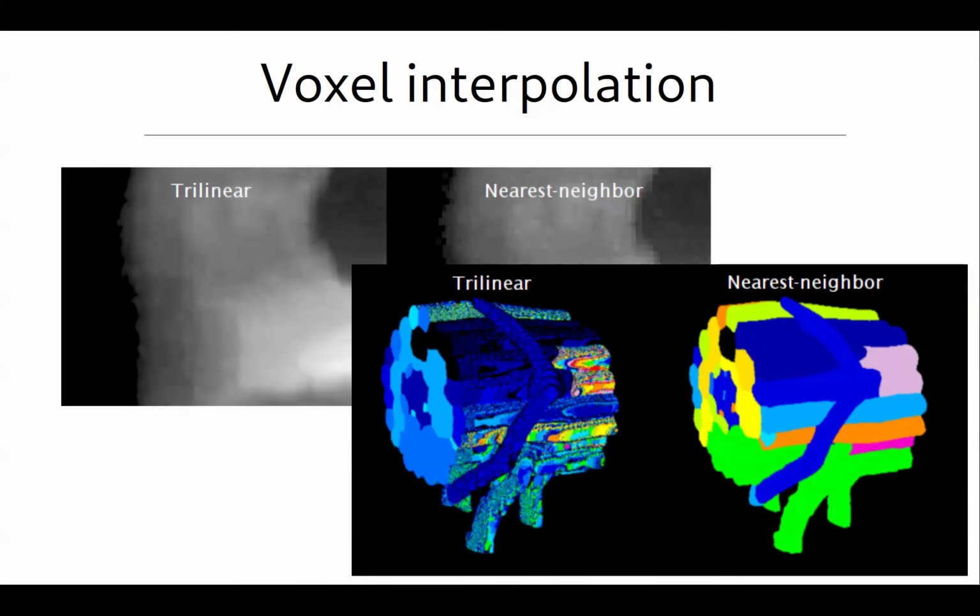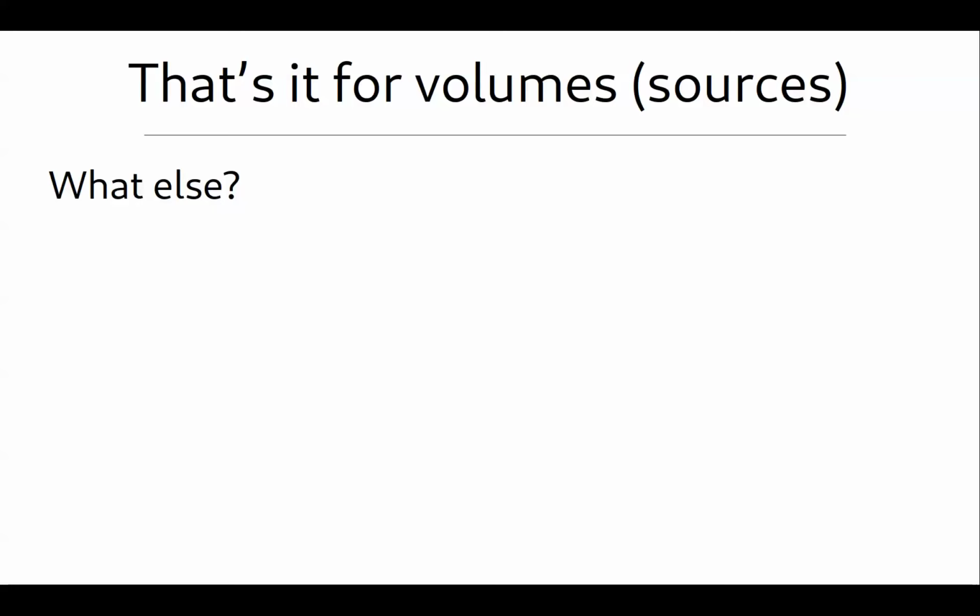Because at the boundaries, the segmentation data is where each cell, for example, the voxels of each cell, is mapped with one number: 1, 1, 1, 1, 1. And then next to it is 10, 10, 10, 10, 10. So then, of course, the interpolation in between is going to give you some kind of artifacts, because in between is going to be 5, which corresponds to another cell, etc. So in this case, you can use nearest neighbor. That's pretty much that. Okay, volumes are done.